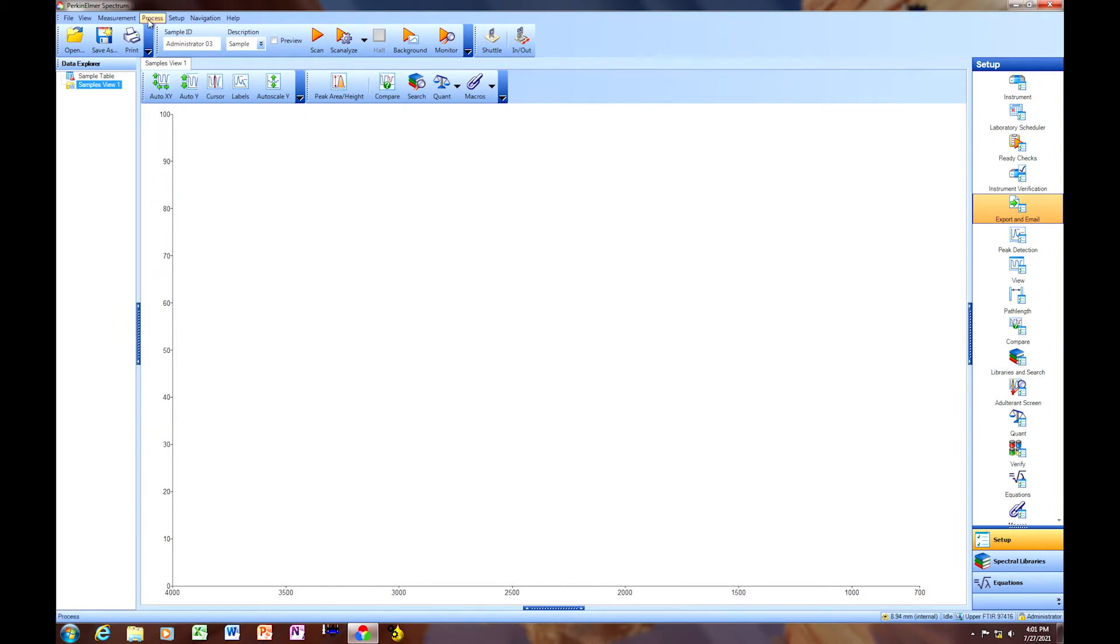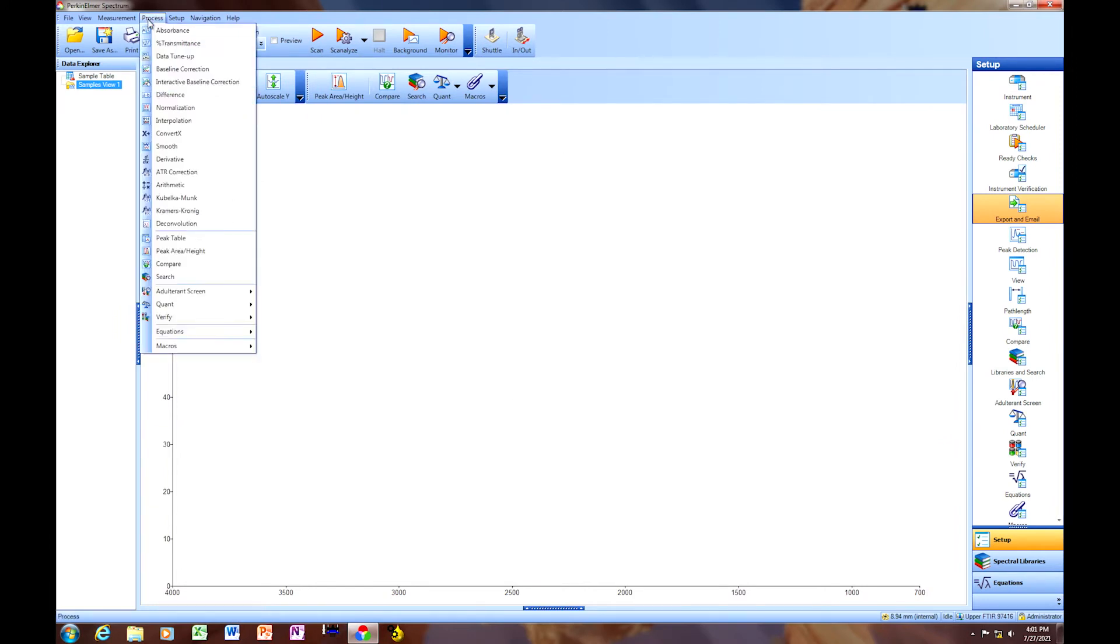Then we're going to go to Process, Macros, Oil Express, Empty Cell.